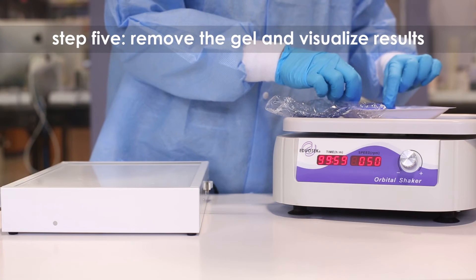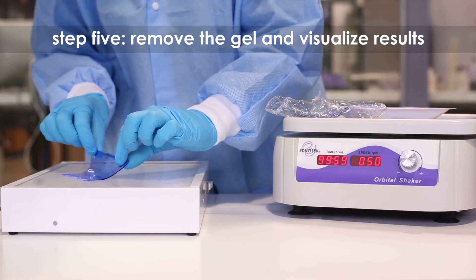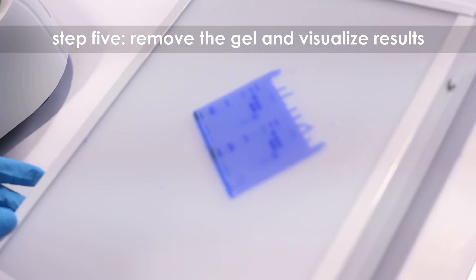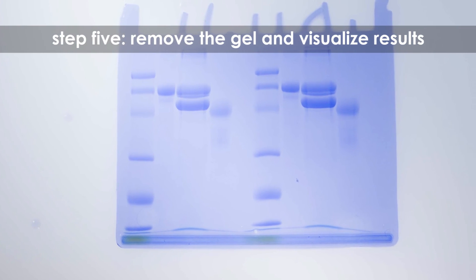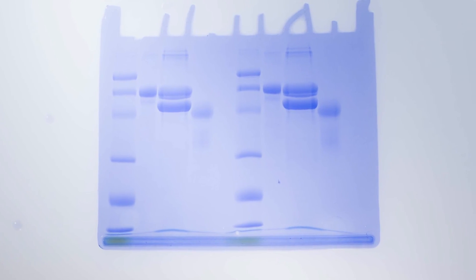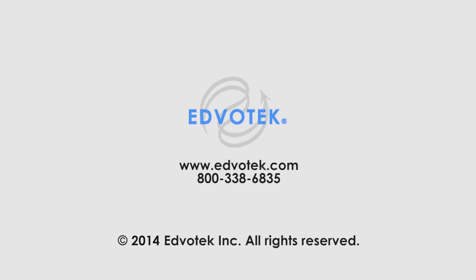Step 5. Remove the gel from the staining liquid. Visualize results using a white light visualization system. Protein bands will appear as dark blue bands on a light blue background. The gel can be stored in distilled or deionized water.